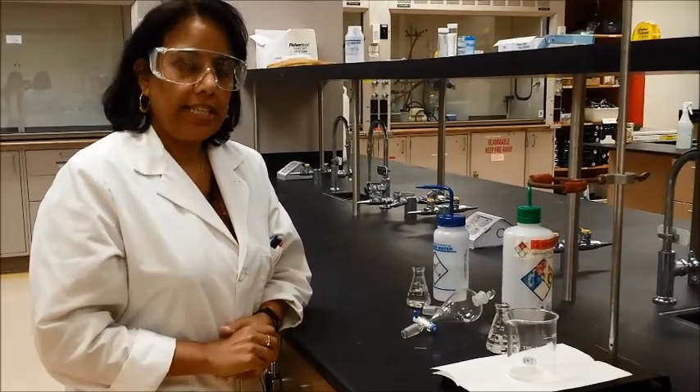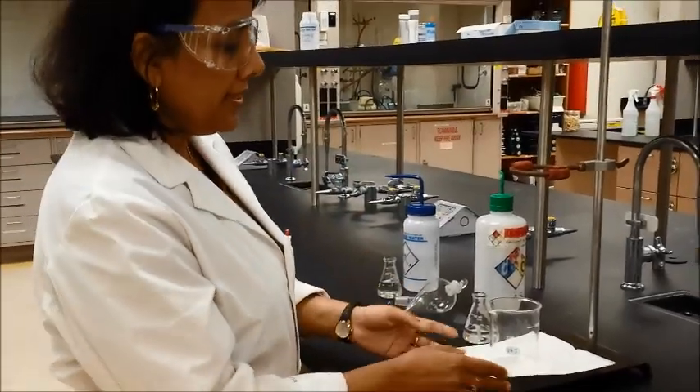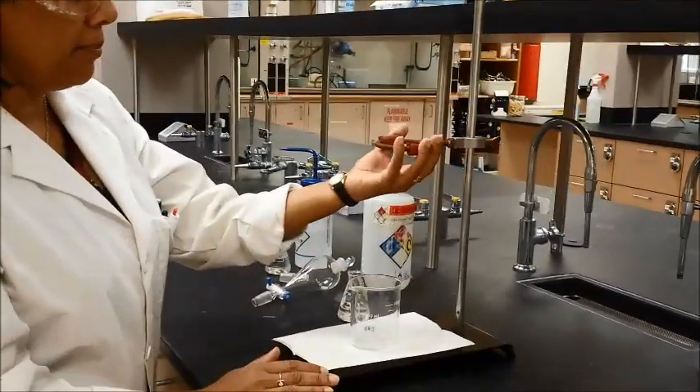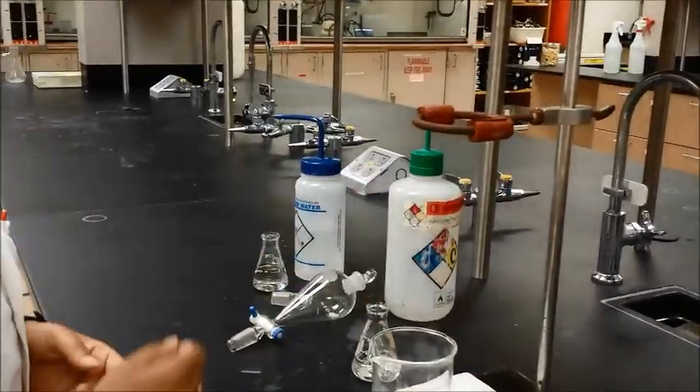We're going to do a little bit of extraction technique today, so you can see how the extraction works. What you will need is a stand to set your separatory funnel on. You will need a ring clamp also. The ring clamp should have a little bit of support on it so that it doesn't break your separatory funnel.